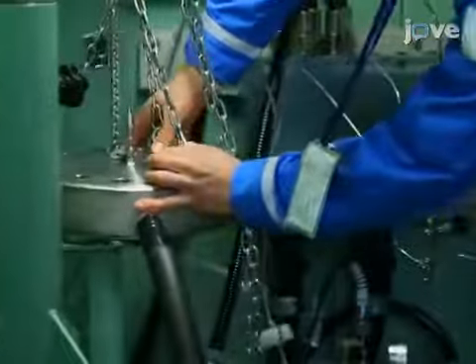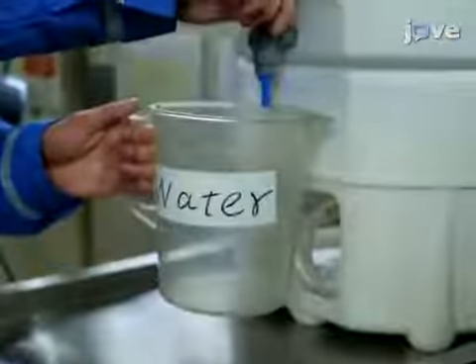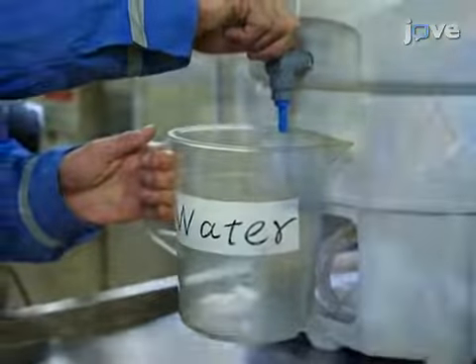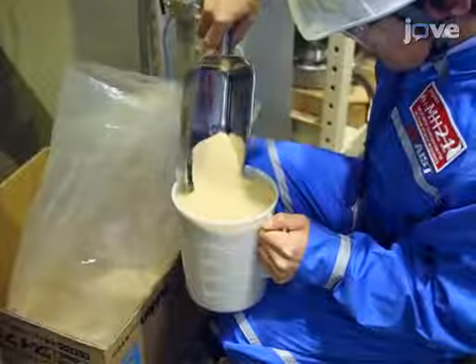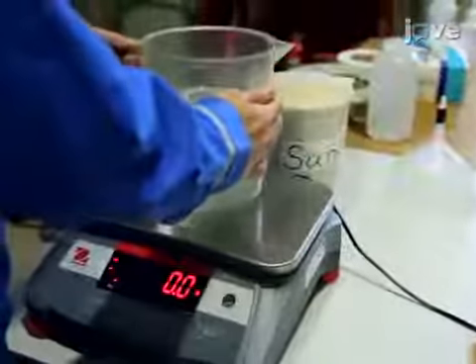To begin, place the high-pressure vessel on the vibrating table. Pour 1.5 liters of pure water in a water bottle and 4,000 grams of silica sand in a sand bottle. Accurately weigh the masses of sand and water in their respective bottles.